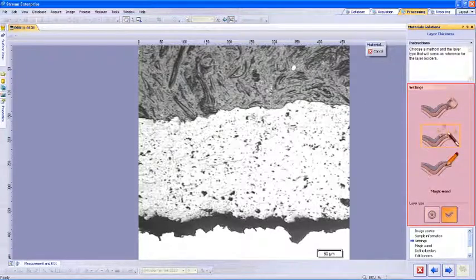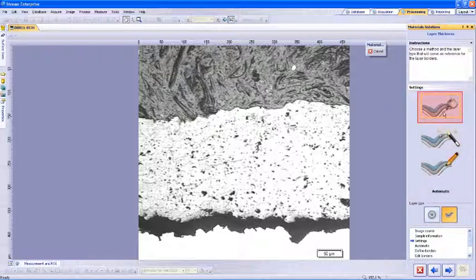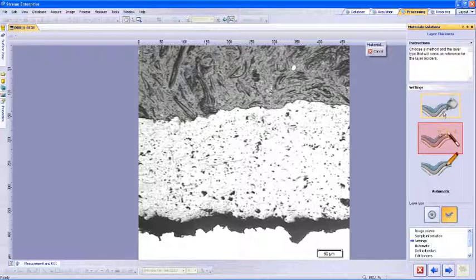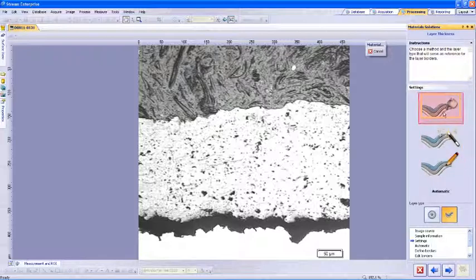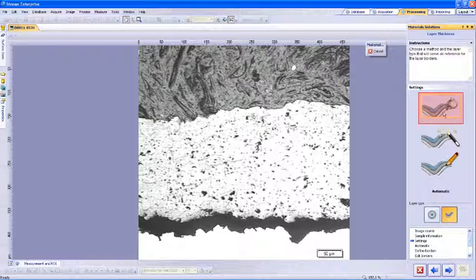Within settings, we have the ability to choose how the contours are to be defined. The choices are automatic definition, magic wand definition, or manual definition. Automatic definition is set to define the contours based on a difference in threshold value between the background and layer. The software will automatically determine this difference.